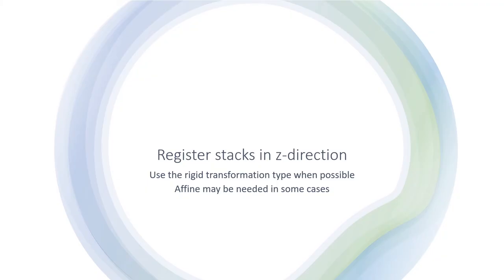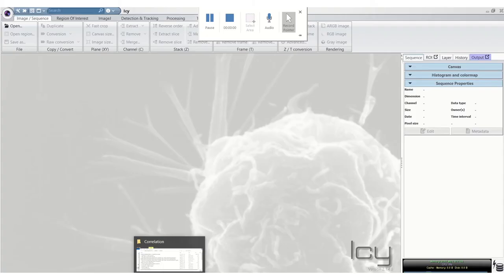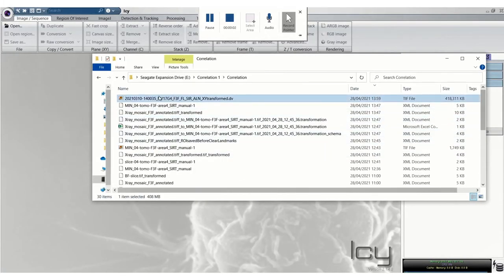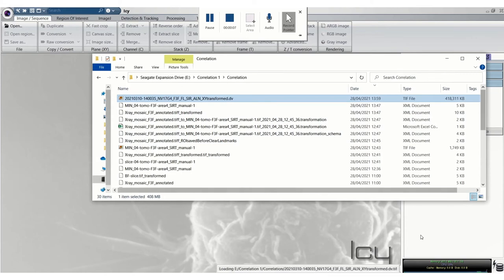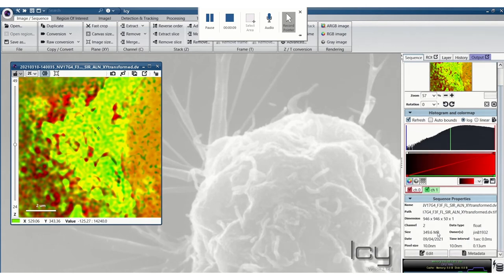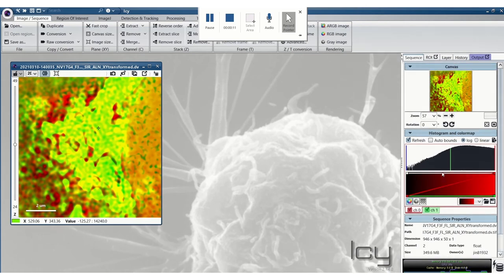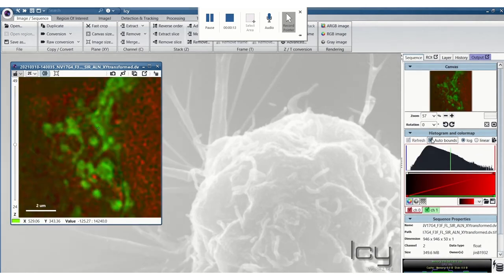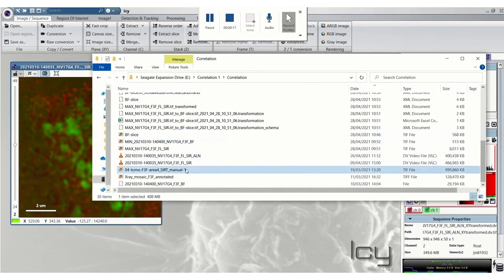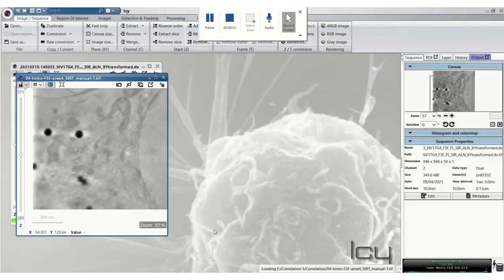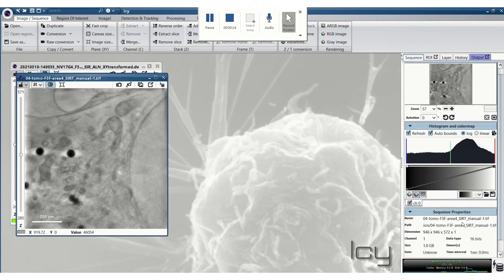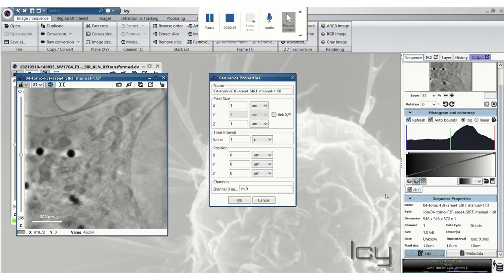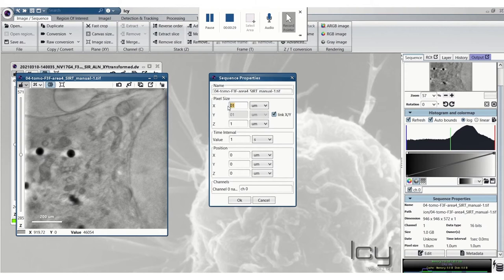So now we can register the stacks in the Z direction. Here, try to use the Rigid option if possible, but you may need to use Affine in some cases. As you can see in this case I had to choose Affine, but if possible do use Rigid. Here, remember to change the pixel size in Z as well.